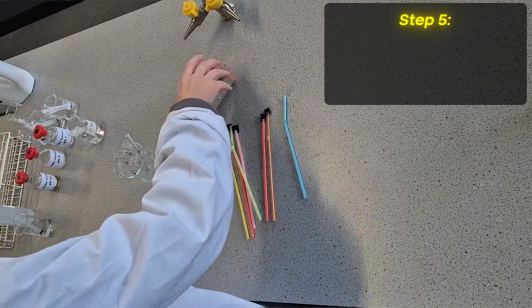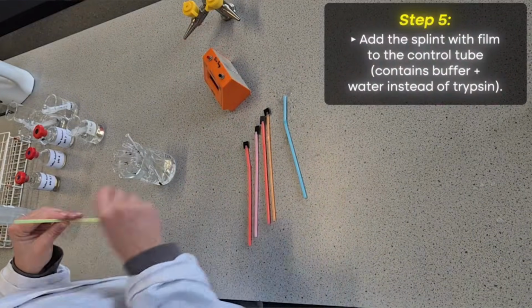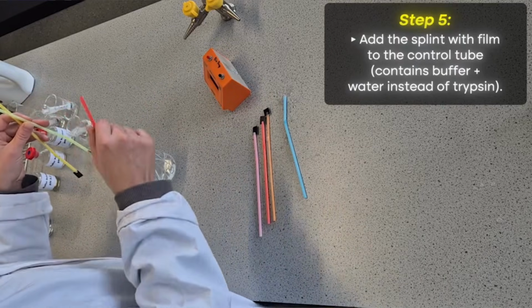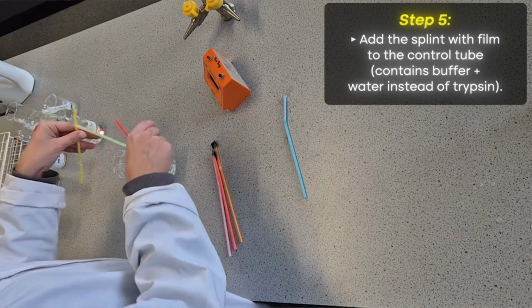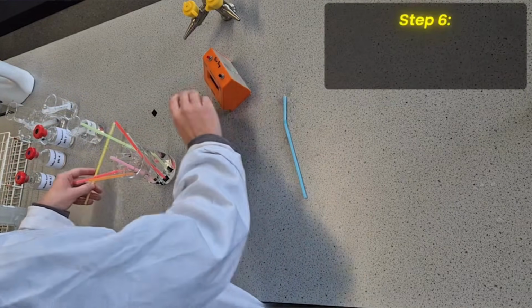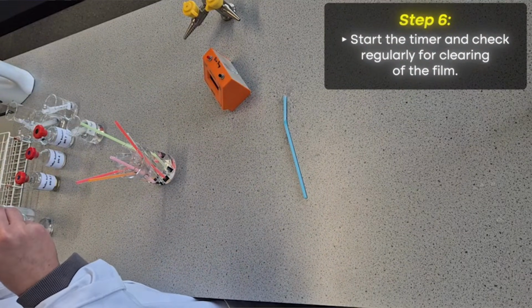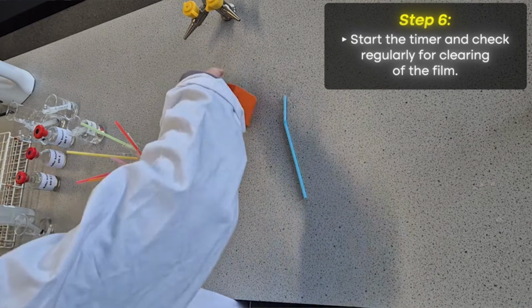Okay, now this bit is easiest if you have 2 people so that you can do this all at the same time. Otherwise it's going to be inaccurate because I now need to get all of these in and start the stop clock. So this is where I do think working in pairs is helpful because I'm just going to have to quickly get those in and start my stop clock. And this one is going to have to be on a separate stop clock because it's going in slightly after. So this one's going in 10 seconds after.